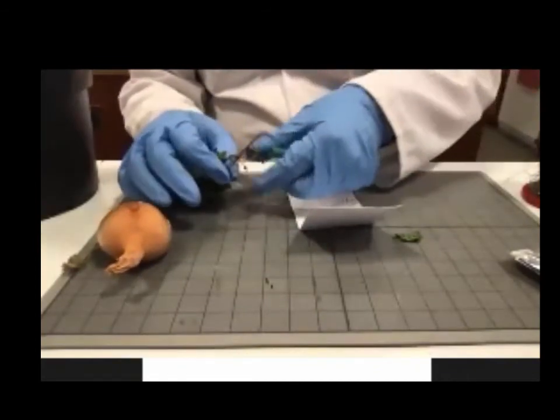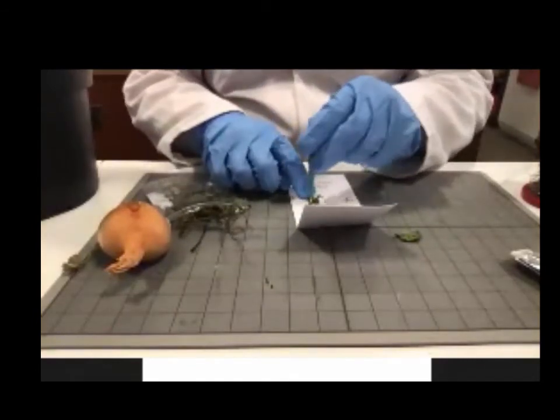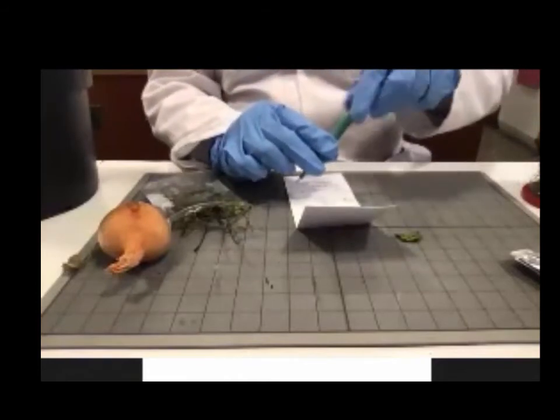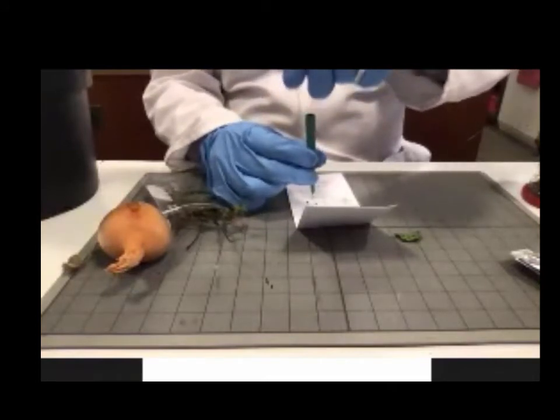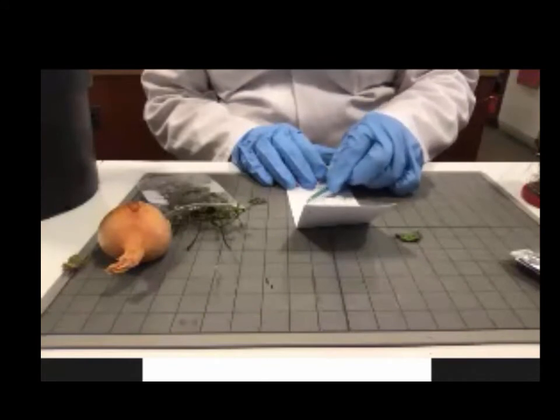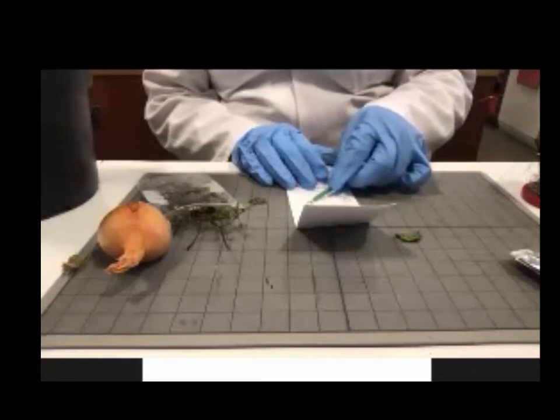So what I'm going to do is get a leaf of the wild native geranium plant. I'm doing it on the card this time. It's probably not what you're supposed to do. Anyway, fish that out with a bit of wire, and again, scrunch it into the paper.